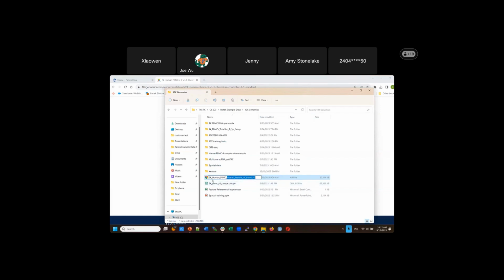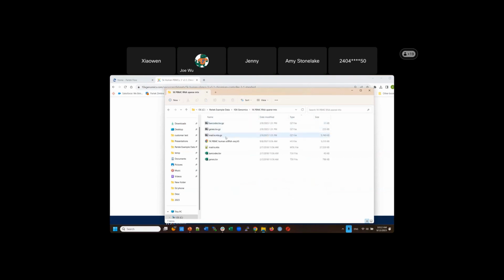And you can append whatever the sample name is for you. So this is one format. And the other one is a folder. It's also called a filtered feature barcode matrix folder, and it contains 3 files. Either they might be zipped or unzipped. One is the matrix.mtx, and then barcodes.tsv and genes.tsv.